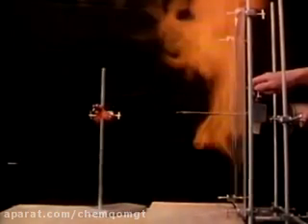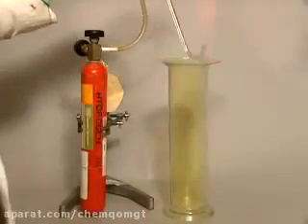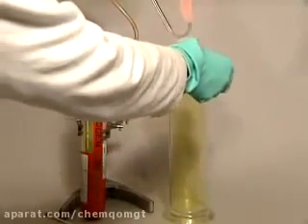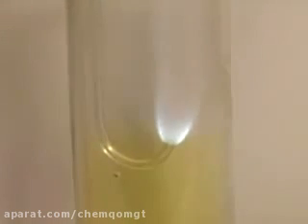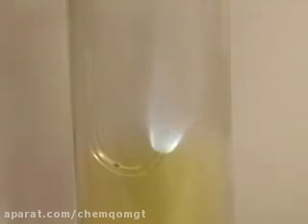Now the reaction between hydrogen and chlorine. I light the hydrogen at the jet and lower it into a jar of chlorine. The hydrogen carries on burning, but with a pale blue flame. When the halogens react with hydrogen, the hydrogen halides are produced: HF, HCl, HBr and HI. In each compound, the halogen has a valency of 1. All four compounds are gases.